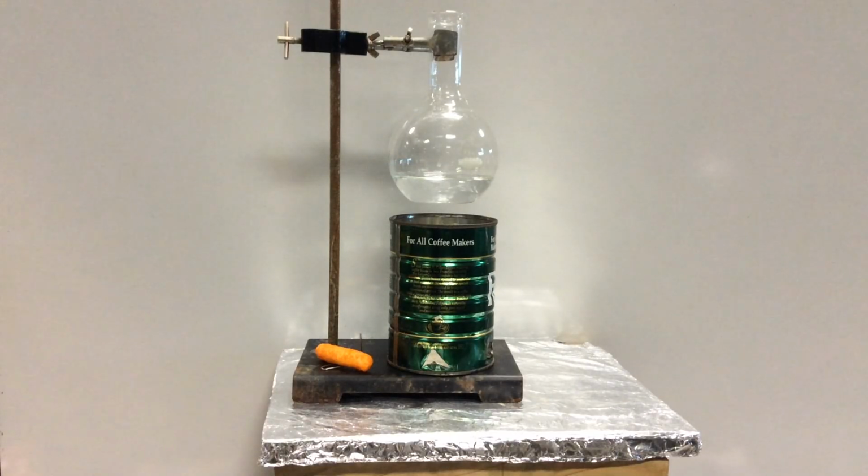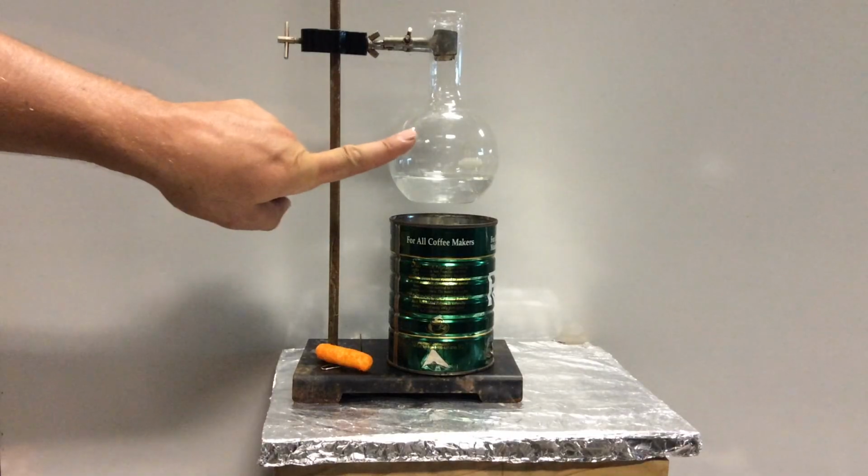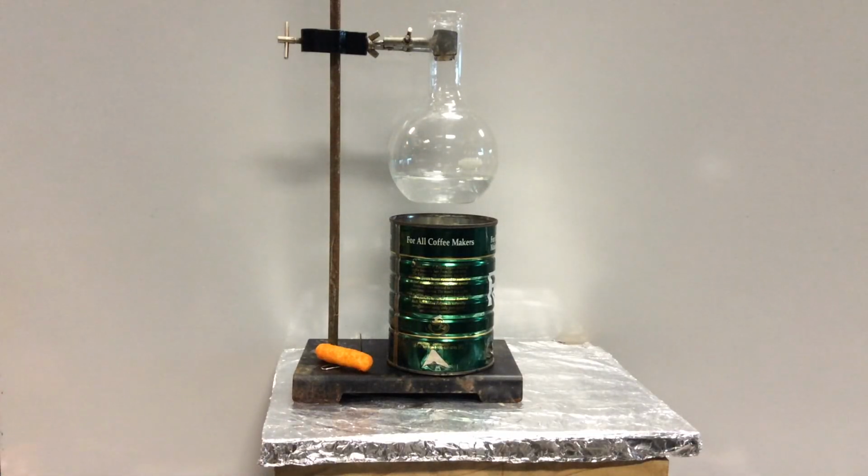I've measured that, and we know that the density of water is about 1, and we can just make that approximation. It's not going to be too bad. If there's 1 gram per 1 milliliter, how many grams of water do I have here? Yes, 100 grams of water. So now I'm going to need an initial temperature, which we're going to write down in a second.